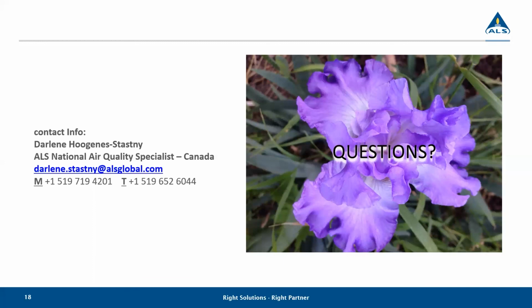Catherine is asking, we have used helium to leak test our sampling setup for sub-slab vapor sampling when using Summa canisters to test for hydrocarbons. Would this affect any of the lab data for the canisters?